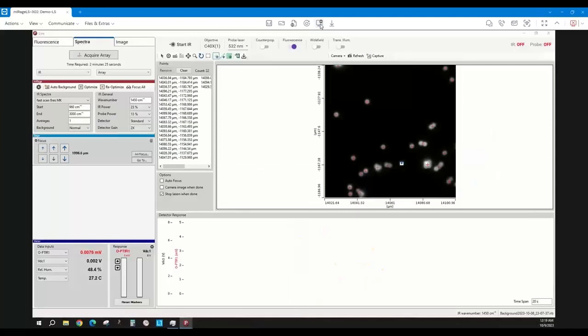Okay, so that was our fluorescent example. Remember, and try and picture how you may take advantage of this in your experimentation. If you were able to fluorescently label your polymers, and imagine there were 100 particles in here and only 10 of them, or even 5, were actually polymers, if you'd labeled them with Nile red, they would be sticking out like this.